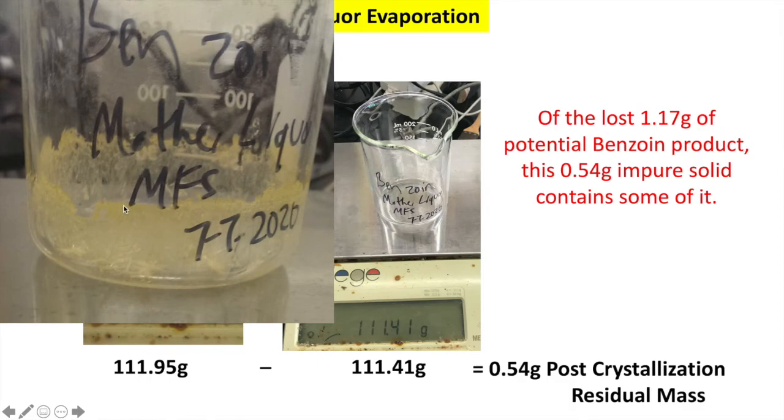If I want, I could crystallize this again to try to get a second crop, and maybe even a third crop. Or I could say, 0.54 grams, I got a pretty good yield. I think I have enough for my purposes to carry on, so I'm just going to let it go. If I were in more of a research setting, a company making a drug for sale, I might just collect this each time, save them, and then after a while I'll have a lot of it and crystallize it again. But I think this is fine for now. It's just something interesting to think about.